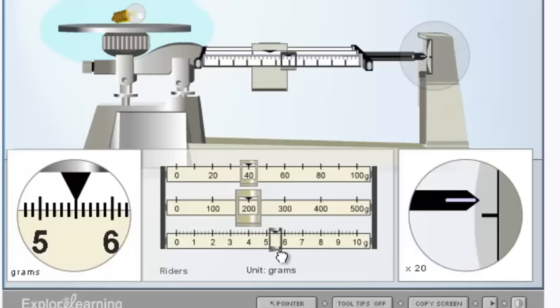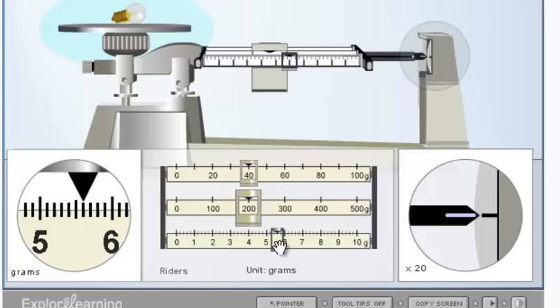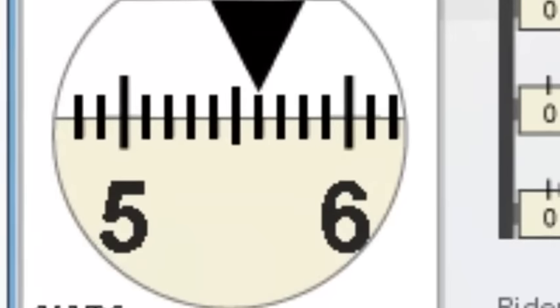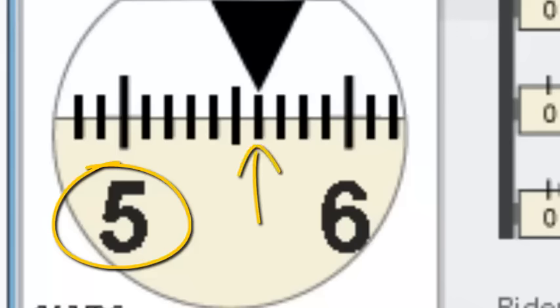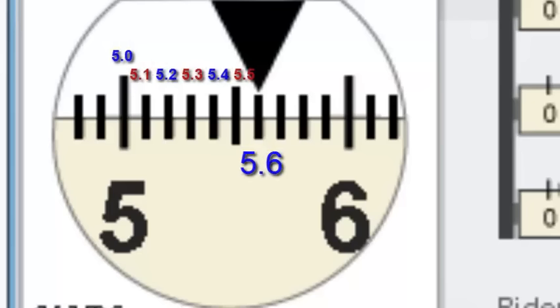Okay, so if we take a look we are perfectly balanced at this point here. So now what I have to do is figure out how many grams I moved on the ones rider. As you can see I've moved to five grams here but I had to go past five grams. So now I have to figure out how many tenths of a gram I moved over. This is five, 5.1, 5.2, 5.3, 5.4, 5.5, and the arrow lands at 5.6. So I had to move over 5.6 grams on that rider.